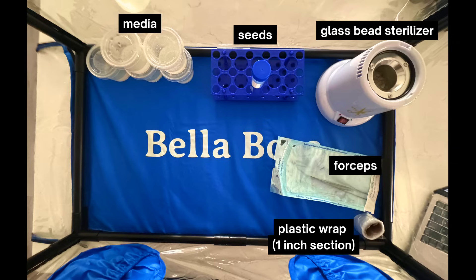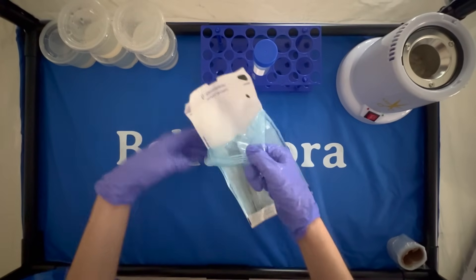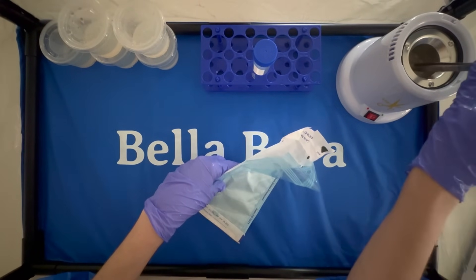Inside of the still air box, I have my forceps which I'll leave inside that pouch until I'm ready to use them. I also have a cheap glass bead sterilizer. I run the cord for the glass bead sterilizer through the side of the still air box. I start by opening the forceps and placing them directly into the glass bead sterilizer.